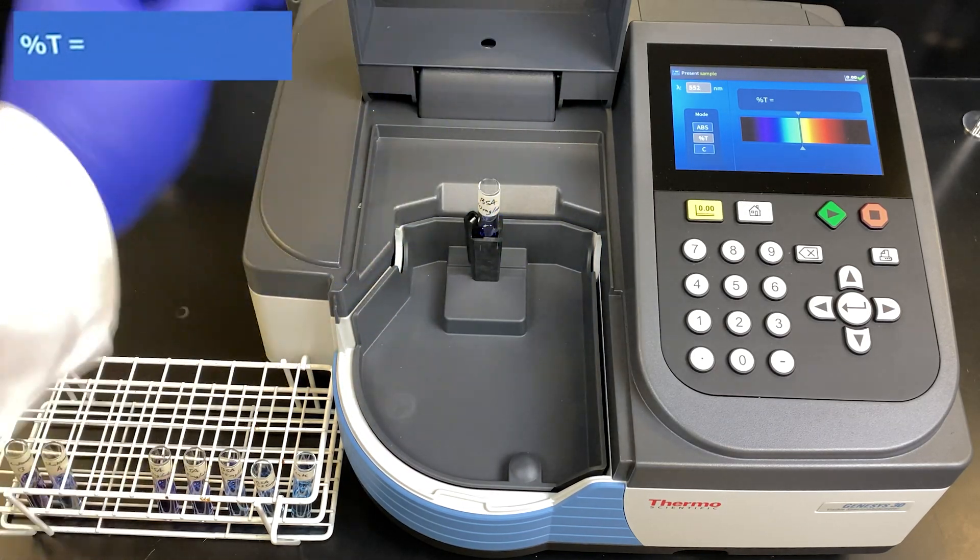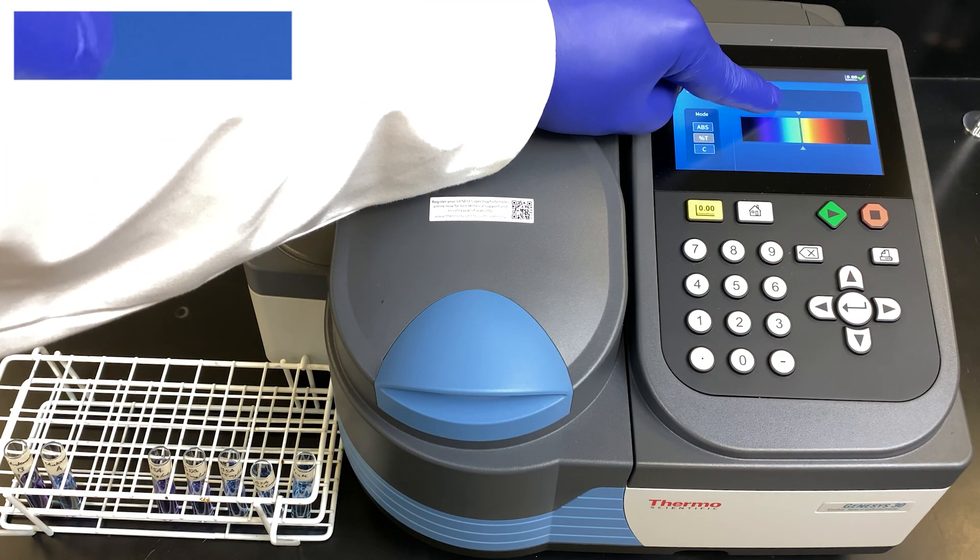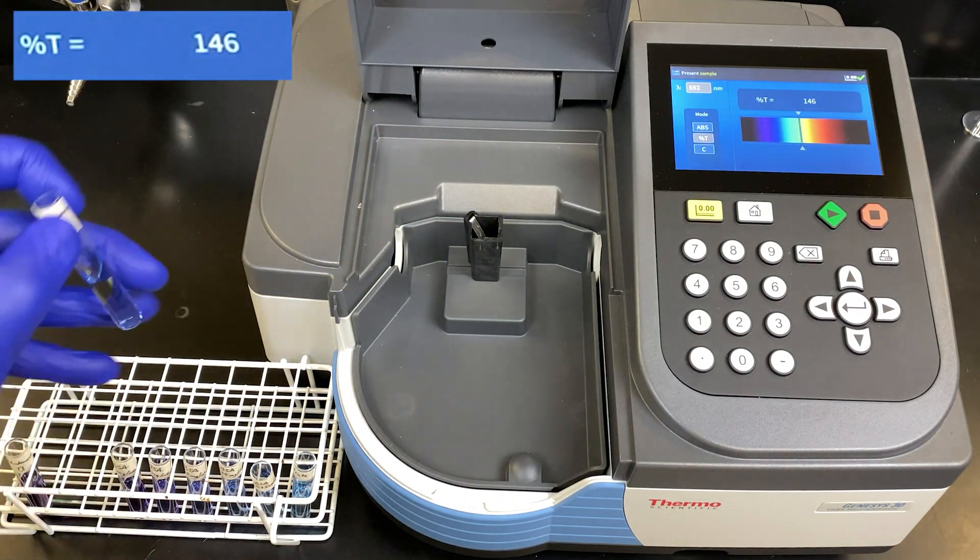Our last standard now goes in, 10 mg per mL BSA. Read off that last value and now we have all the data to make our standard curve. We will plot concentration on the horizontal axis and absorbance on the vertical axis.